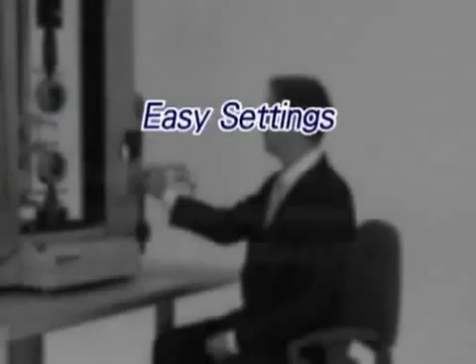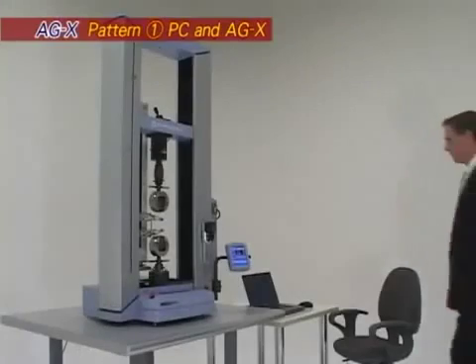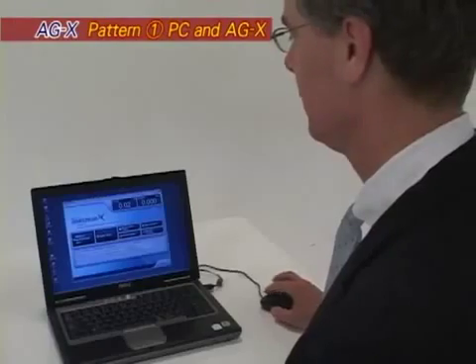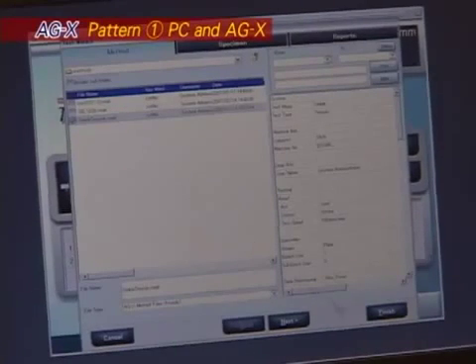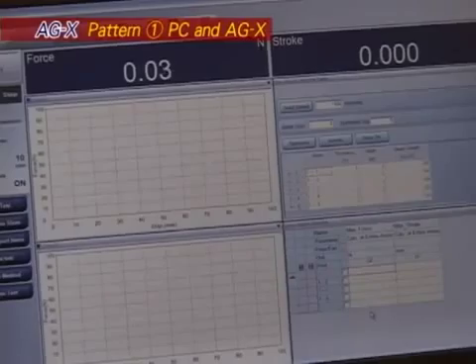Easy setting. Setting up AGX test parameters is amazingly simple. Included with the system, the Trapezium X software allows you to set up your key testing parameters in templates. This eliminates the repeated entering of parameters each time the same test is performed.